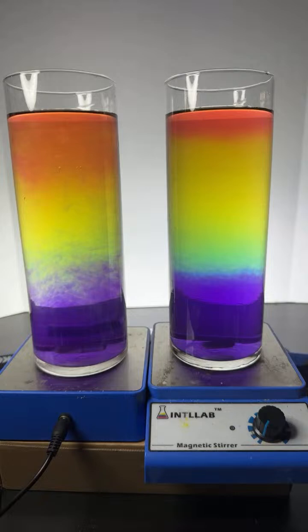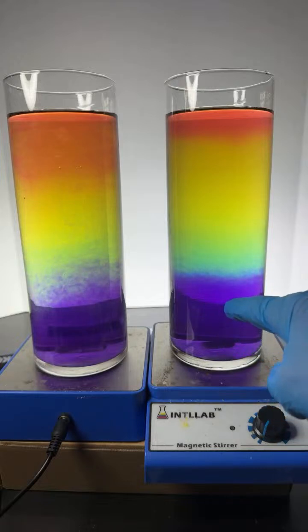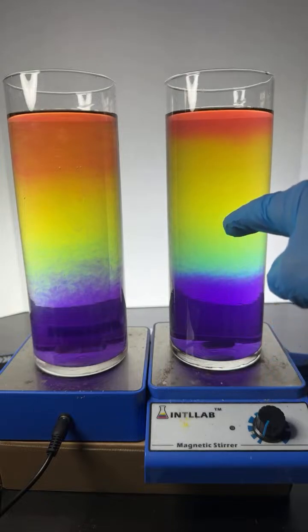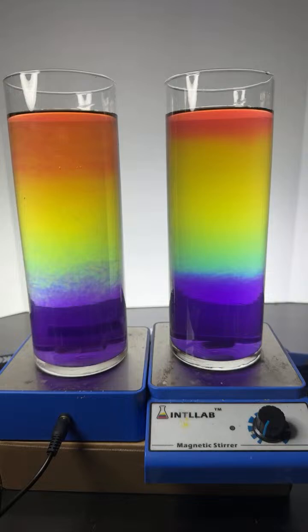I agree, Kiana. We have got some beautiful rainbows going on, beautiful pH gradients. We start down here at pH 10. You can see it go through pH 8, 7, 6, 5, 4, 3 at the top on both flasks. It's really gorgeous. So you, Kalura, you like the Lewis acid-base theory.